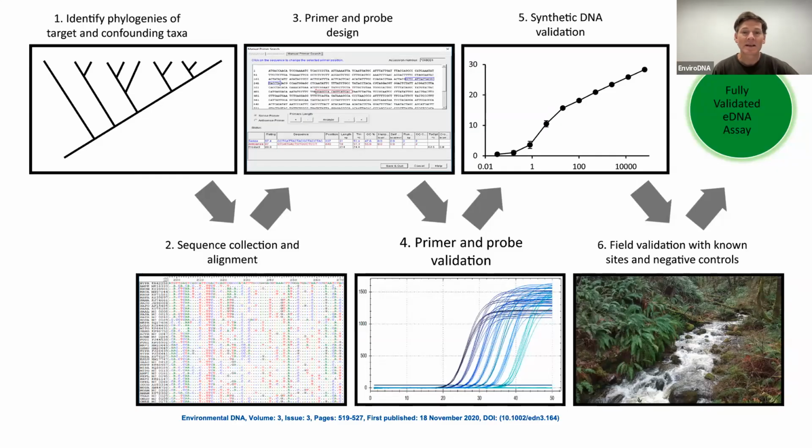And go through all of the technical hoops to make sure that assays are performing efficiently and consistently, and determine their limits of detection and limits of quantification, etc. At which point we can then test in an appropriate experimental context with controls, eDNA samples. And so from there, we arrive at something that we would consider to be a validated eDNA assay. So very data dependent process.